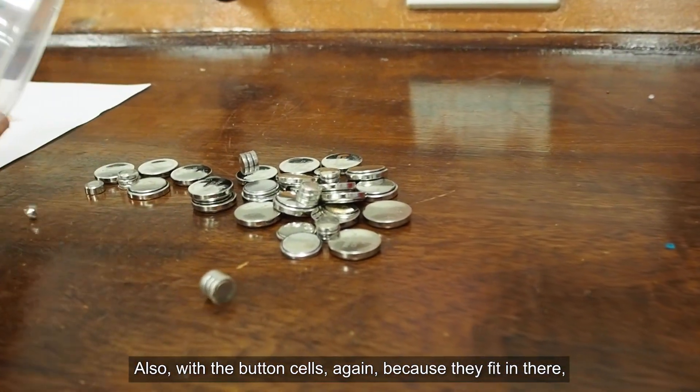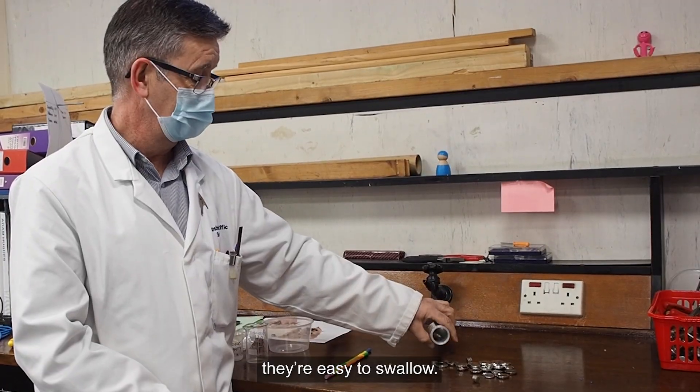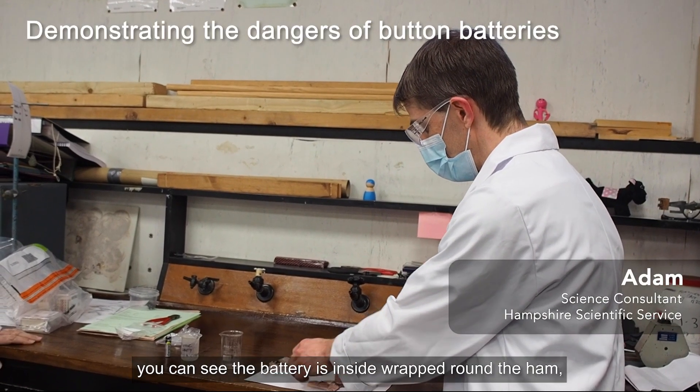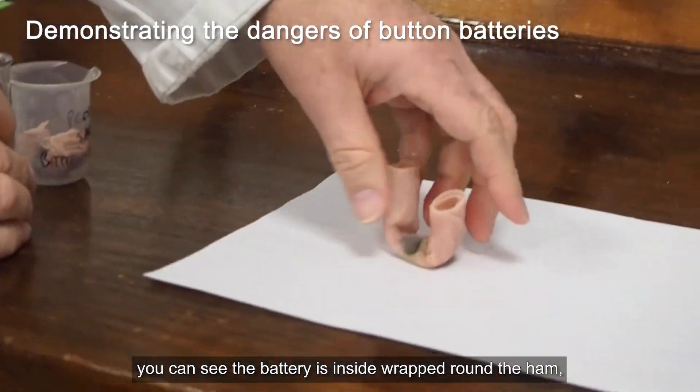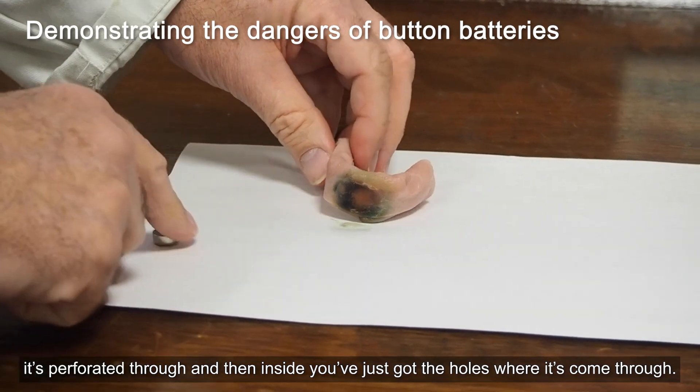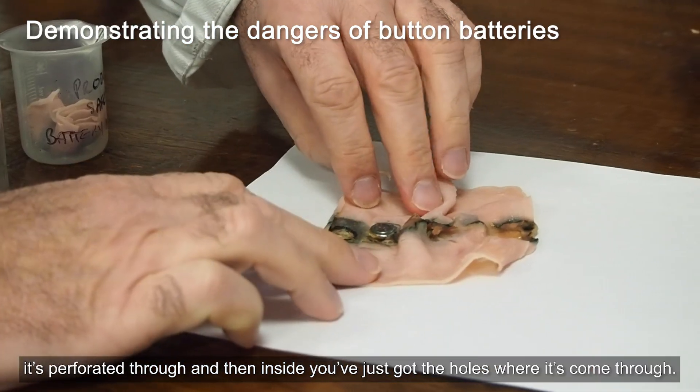Also with the button cells, again because they fit in there they're easy to swallow. This is an indication of what happens if you swallow a battery. You can see the batteries inside wrapped around the ham — it's perforated through, and you can see the holes where it's coming through.